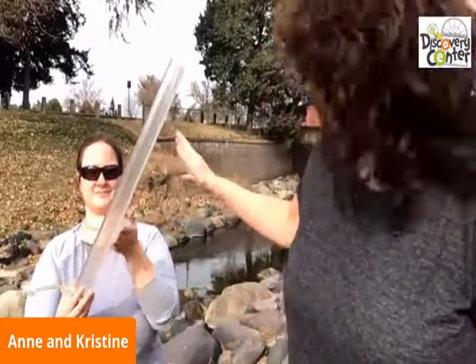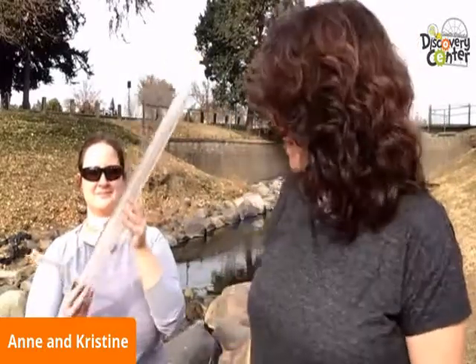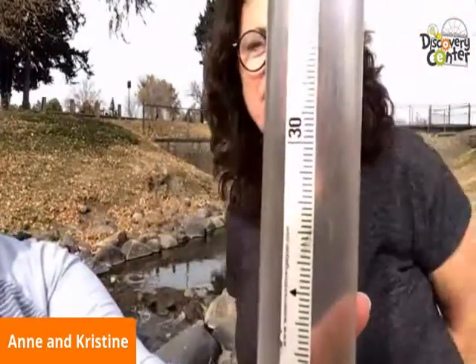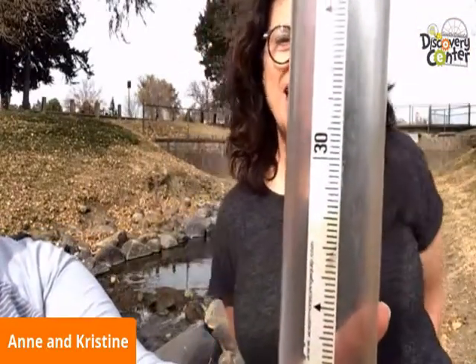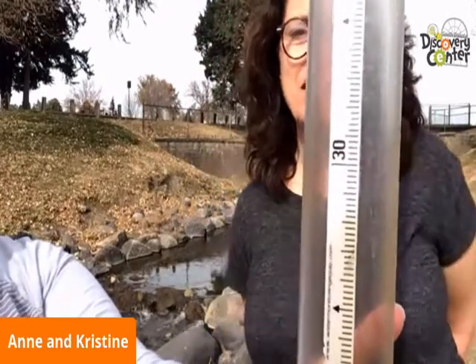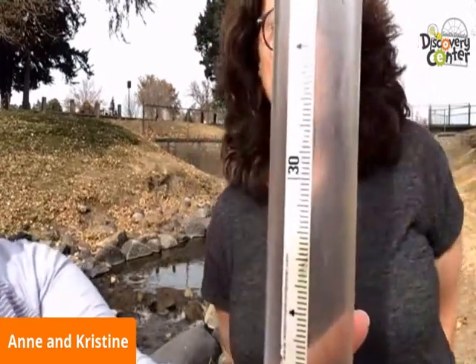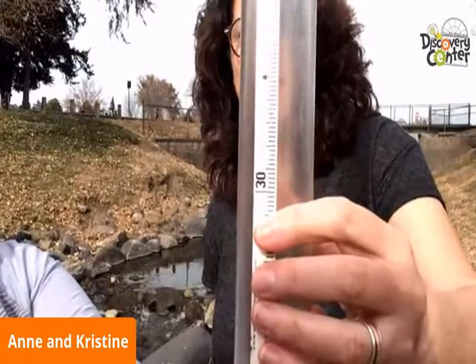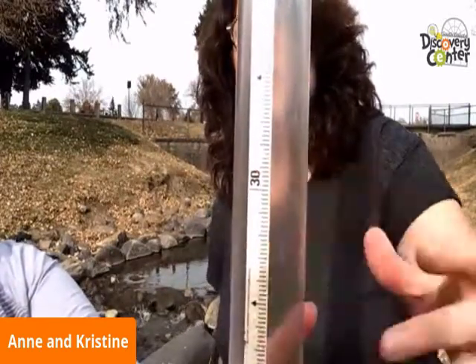So the first part of our T-tube is the actual tube. And this, we're going to pour some water down here in a little bit. The next part I want you to see is this measuring tape along the side. And you can see there are 3 different lengths of lines on the measuring tape. There's the big one that's near the 30, and then there's the medium-sized one, and then there are the little ones. Now this medium-sized one right here, that is actually 29, and this one above is 31. 31 centimeters, 29 centimeters. And then the shortest ones are millimeters.